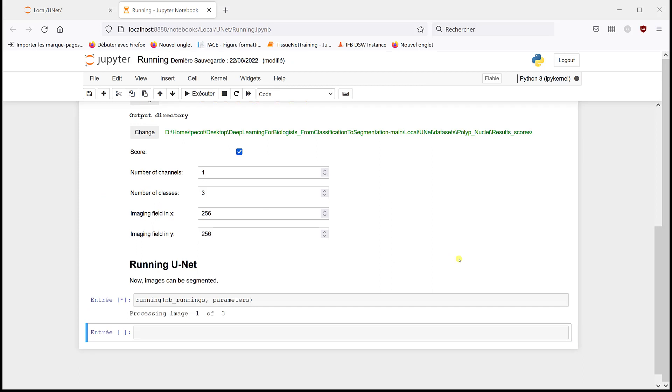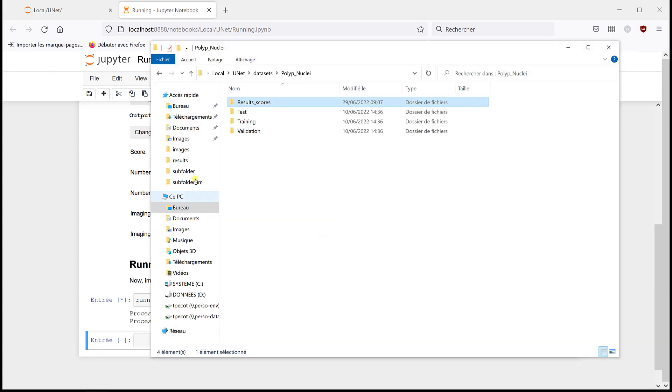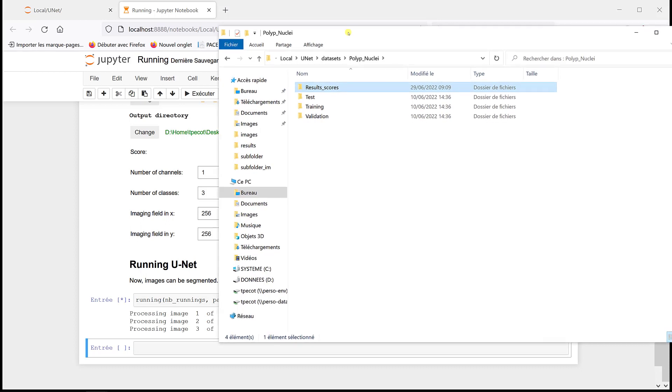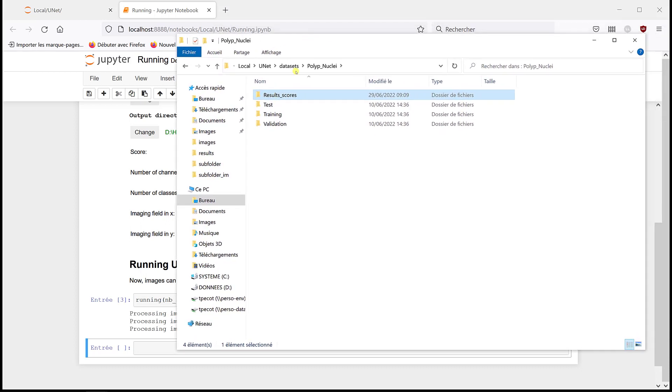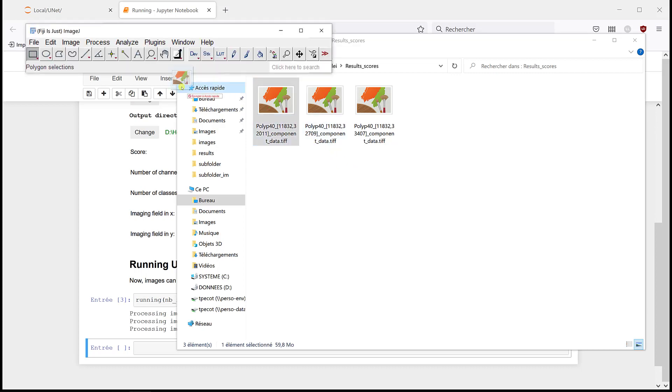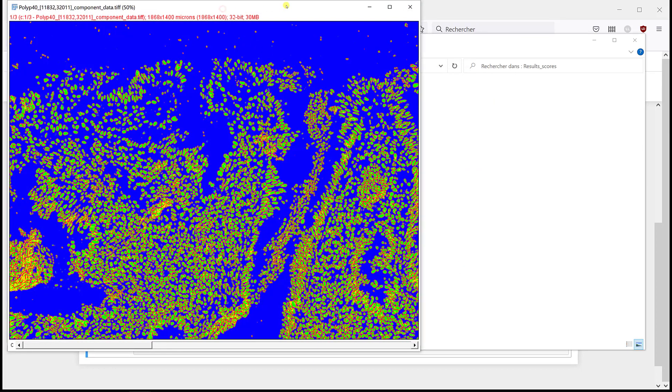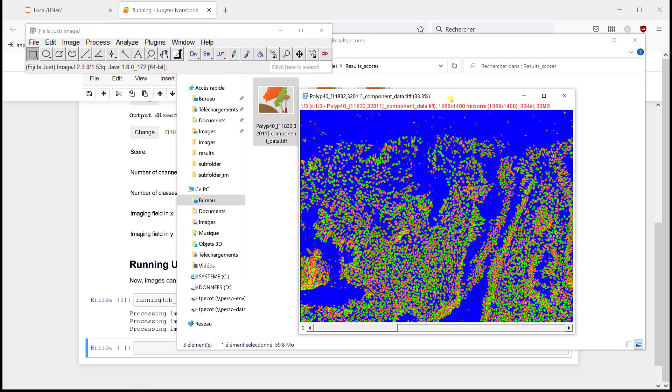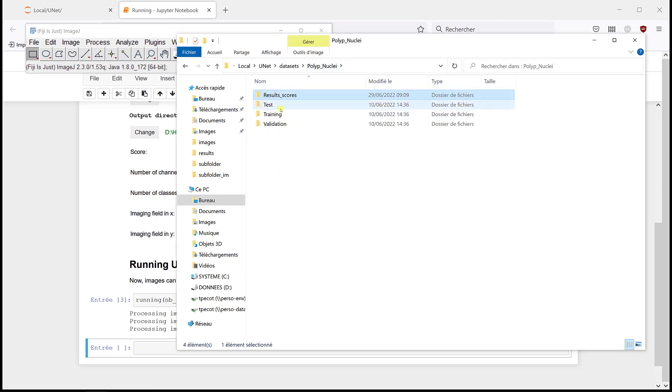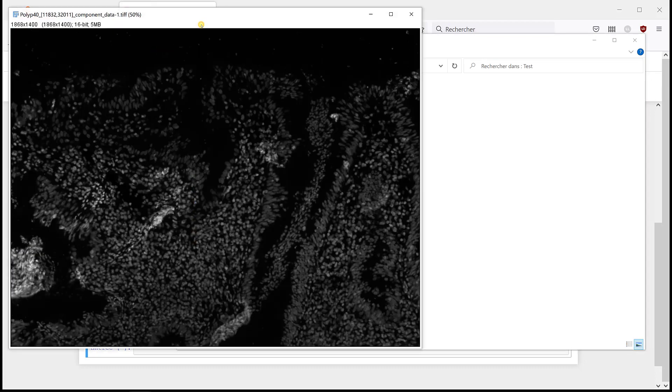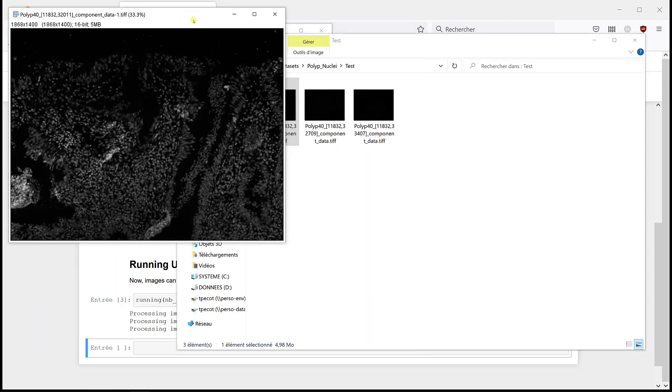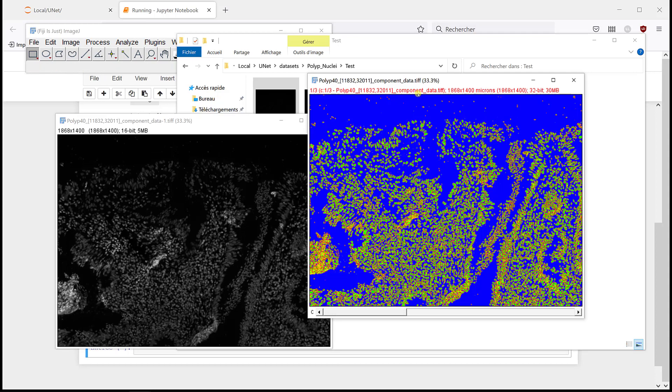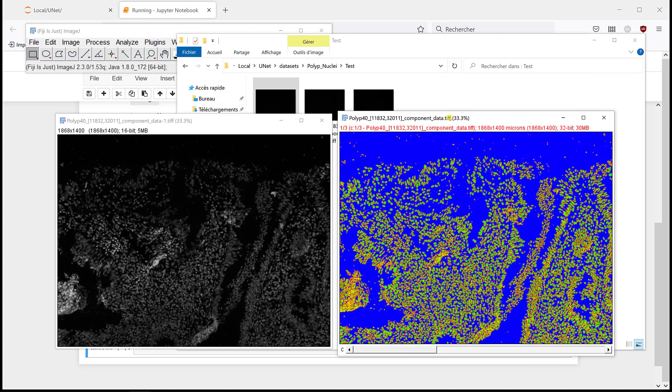It's processing. As usual, the first one takes a little bit more time because it needs to load the level and it goes a little bit faster. So over here, one, two, and three, and it's done. If I go in results scores, I have three images that I can open with Fiji. And let's have a look at what data it is.